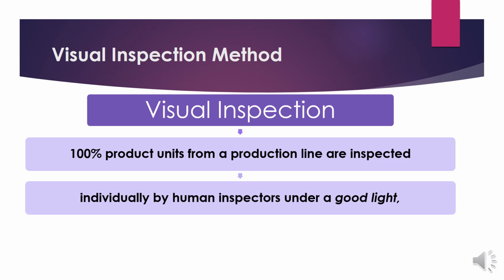How is it performed? These product units are inspected individually by human inspectors under a good light.